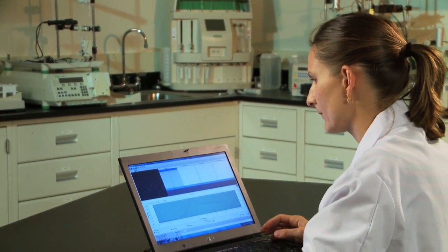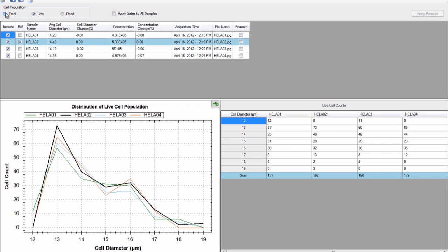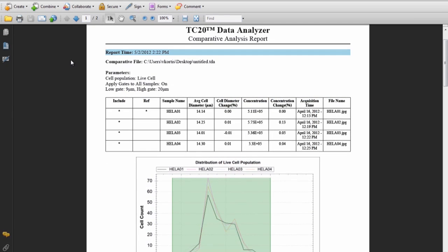For further post-count analysis, you can use the TC20 data analyzer software on your PC. This software will allow you to analyze single JPEG files, compare multiple files — for example, for a time course study — and prepare reports.